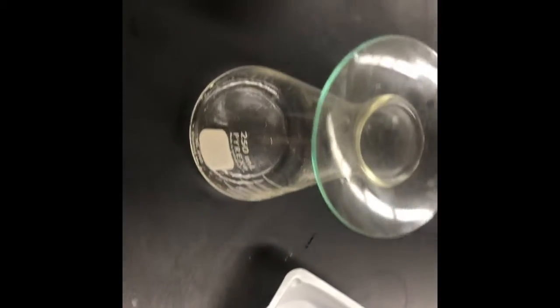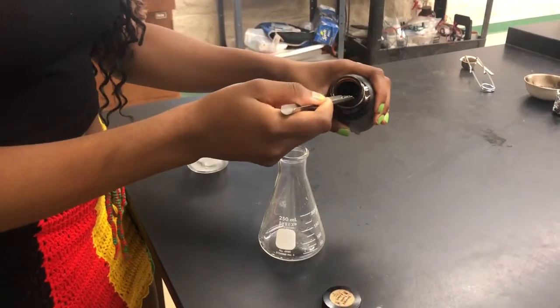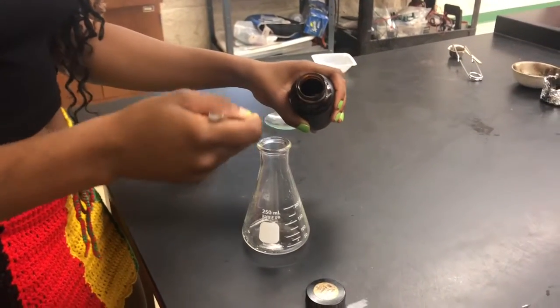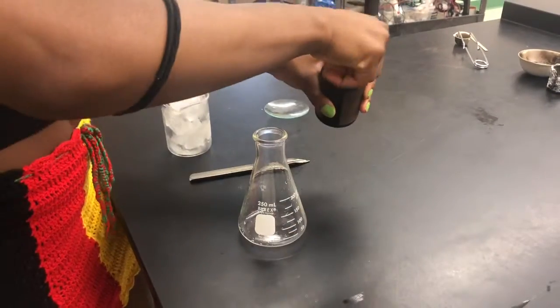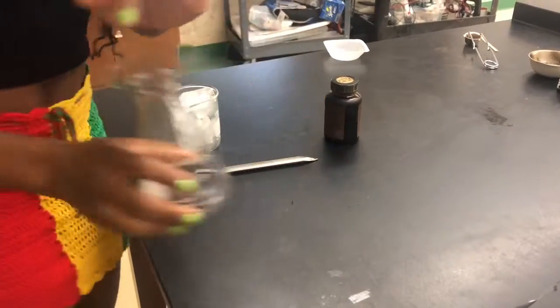Moving on to the iodine crystals, the materials needed include an Erlenmeyer flask, watch glass, a scoopula, some ice, and iodine. So, in this process, take a very little amount of iodine and place it into the flask. Then you put a watch glass followed by a piece of ice on top of the flask. Once that is done, place the entire thing on top of a hot plate.